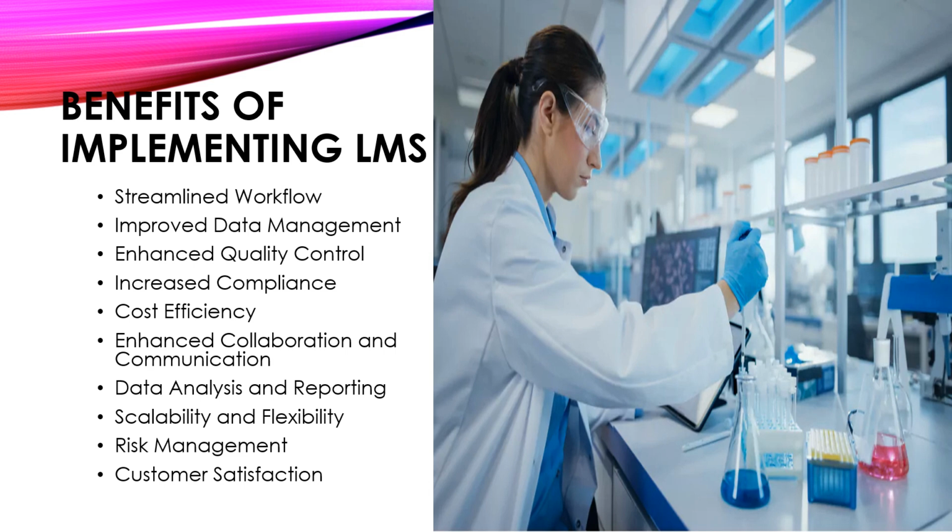Cost efficiency. By optimizing resource utilization, reducing manual errors, and minimizing rework, a laboratory management system helps laboratories operate more cost-effectively. It enables better resource planning, inventory management, and utilization of equipment and personnel, leading to cost savings in the long run.